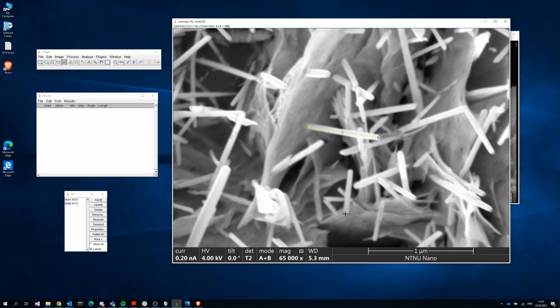Add it. Add it. And again, remember, if you want to see all the measurements you've taken, just click show all. This is just to show everything. So we have 3. We can come back here. Let's say I screw up too long, but I've added it. You could just go here and delete the single one.